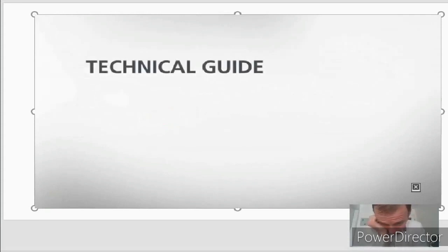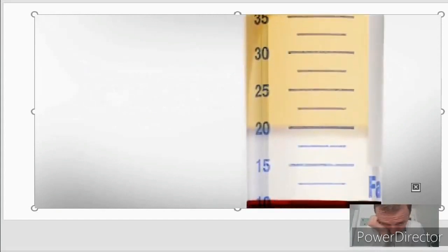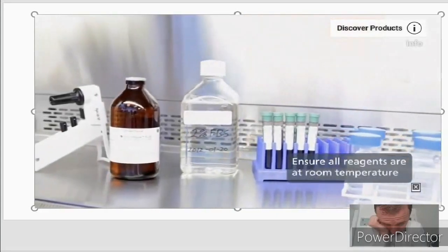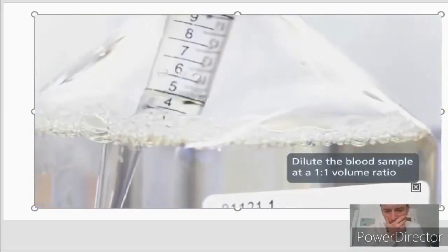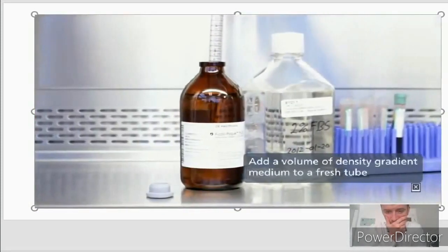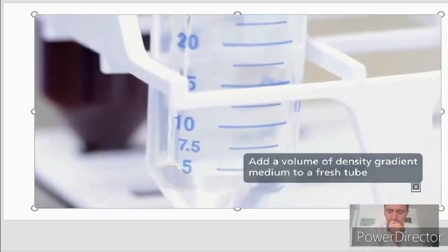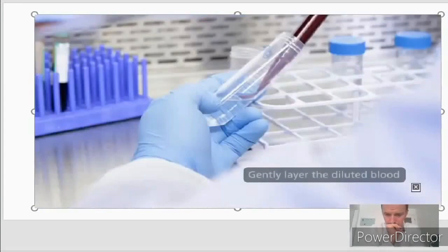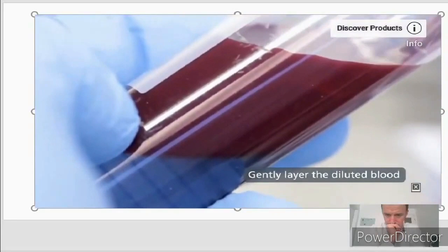The following video is a technical guide that demonstrates how to isolate mononuclear cells from whole blood by centrifugation through a density gradient medium such as Ficoll-Paque Plus. To begin, ensure all reagents are at room temperature. Dilute the blood sample at a 1:1 volume ratio with the appropriate medium. Add a volume of density gradient medium to a fresh tube according to the specifications for that density gradient medium. Gently layer the diluted blood on top of the density gradient medium. Take care not to mix the two layers.